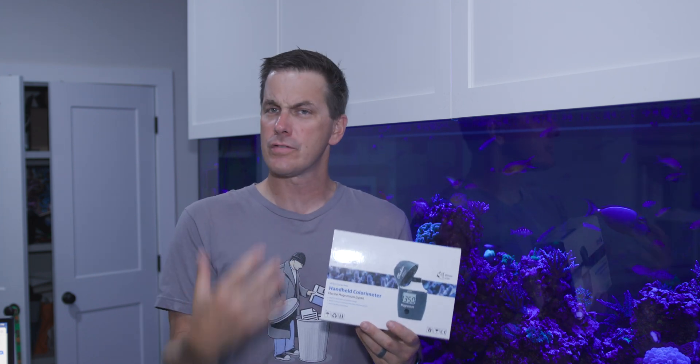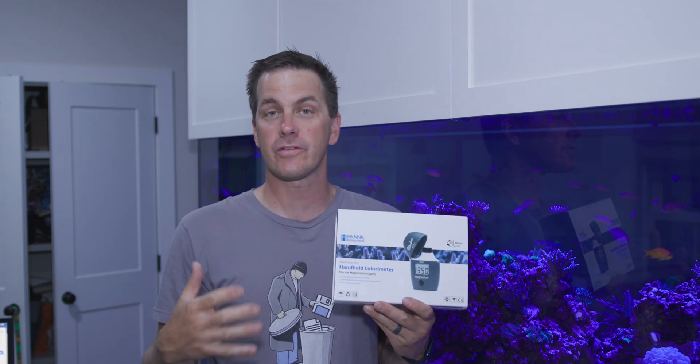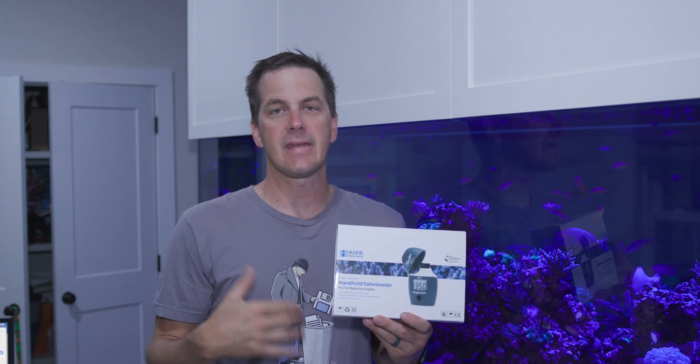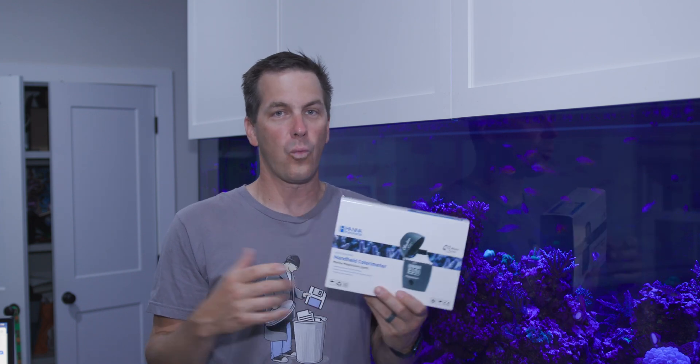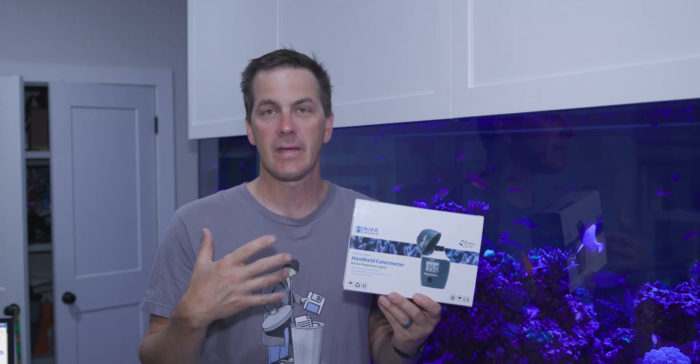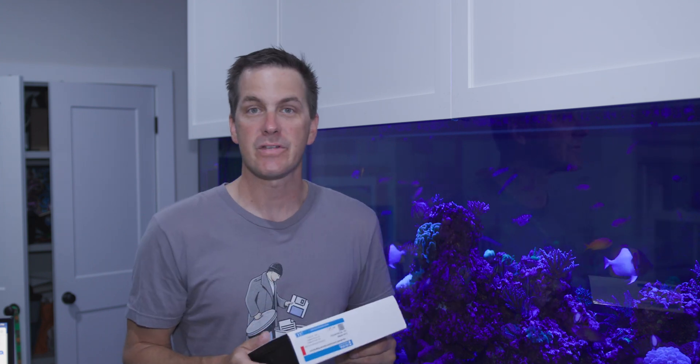Then, I'm going to use it for a couple of weeks, put it to work in the field. My tank, client tanks, I'm going to see the results of this thing against a normal test kit and against Neptune Systems Trident Automatic Tester. I want to see what's more accurate, what's closer to what we think is a given magnesium level in certain tanks, and see how this thing holds up over the test of time. Today, I'm just going to run this thing blind and give you my impressions. With that, let's jump into it.